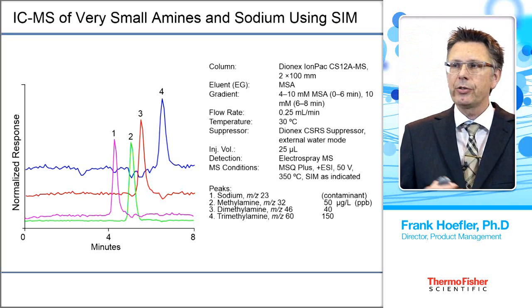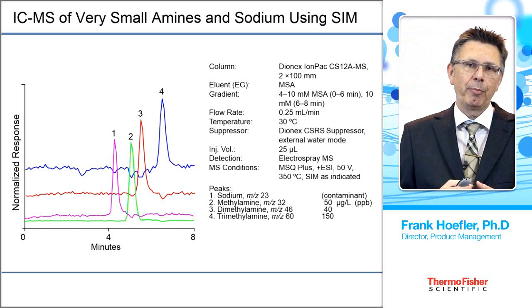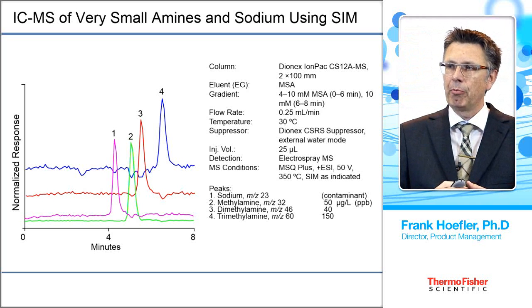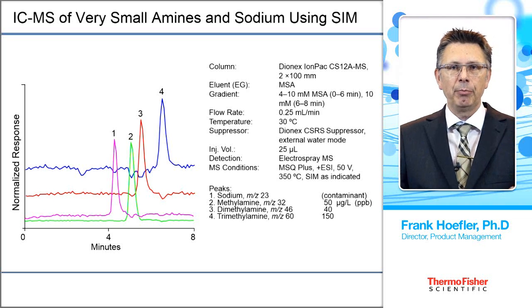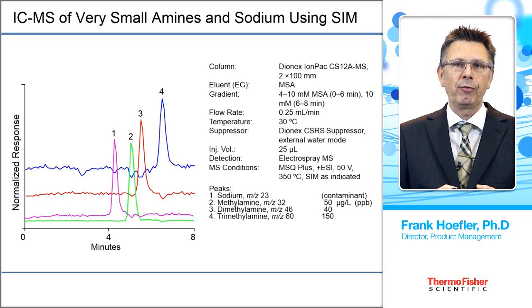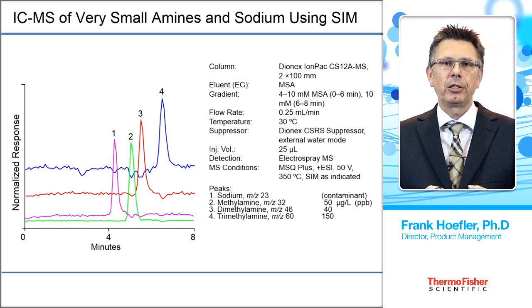They have a small mass, and they are ideal for MS detection, as shown in this example. We also see that these ions are closely eluting, and the MS really helps us separate all these peaks, makes the identification of the peak start and the peak end very easy and straightforward, and gives good quantitative results.